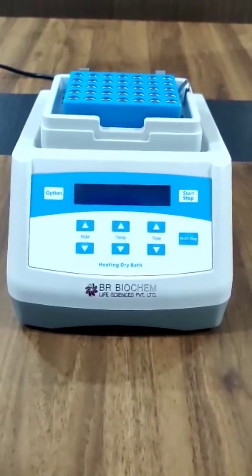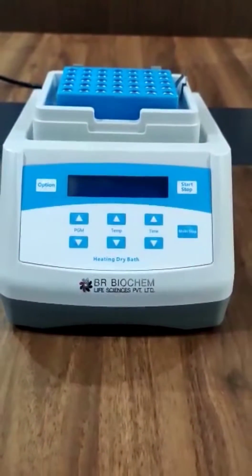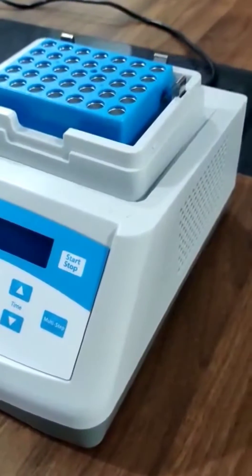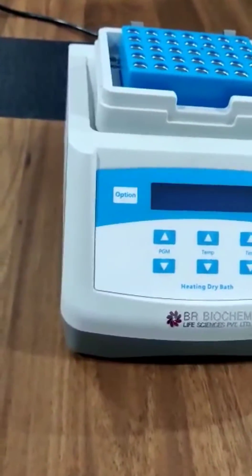Hello everyone, welcome to BR Biochem Life Sciences Private Limited. Today we discuss about the dry bath incubator. As you've seen in this video, this is our dry bath incubator. This is the microprocessor control-based dry bath incubator.